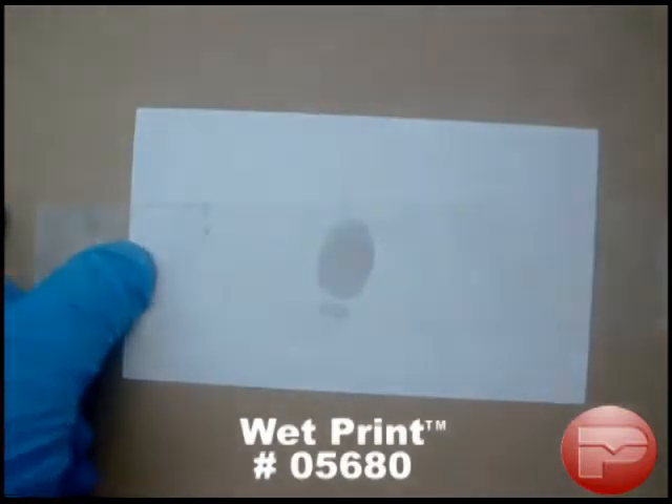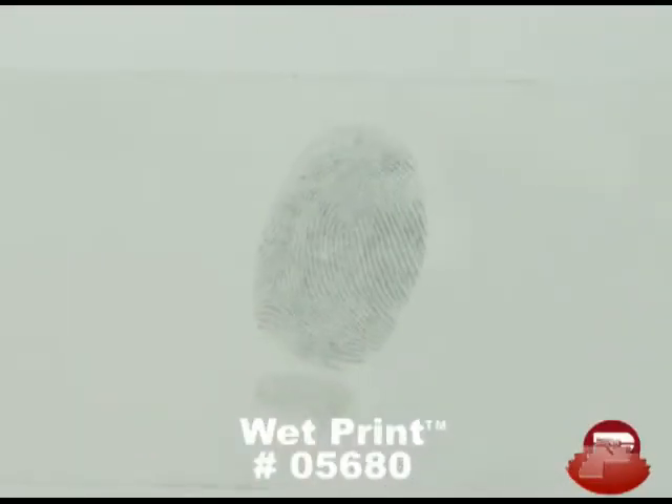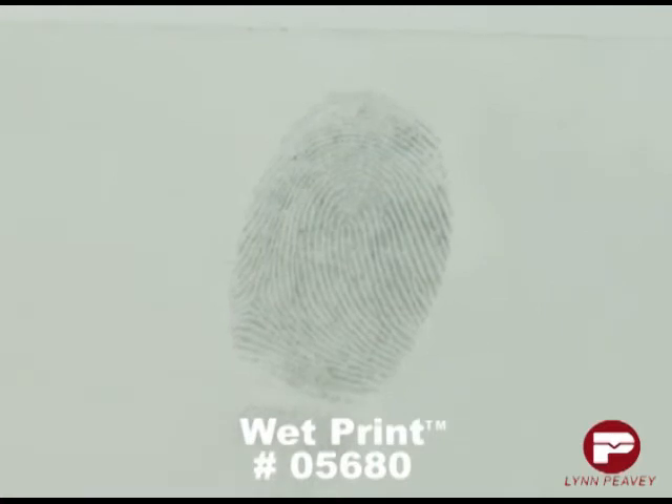It should be noted that sometimes ridge detail will barely be visible until a print is lifted and placed on a contrasting backing card.